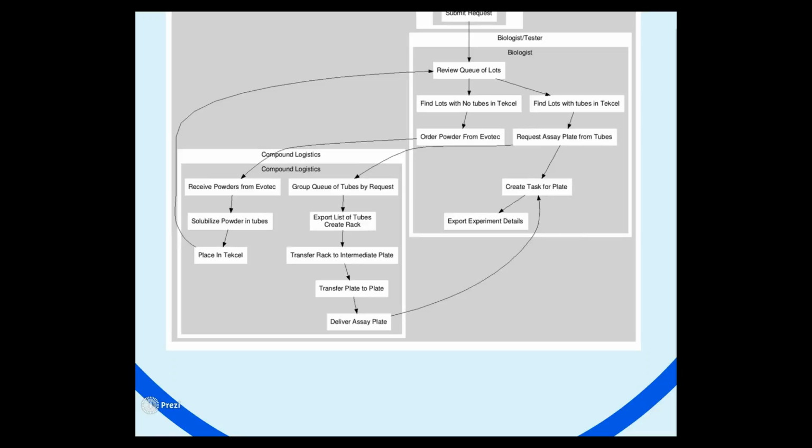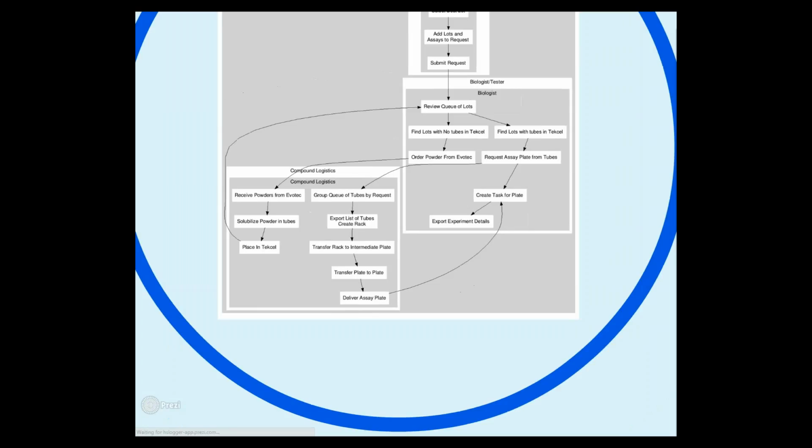So again, here we're interacting between project teams, between assay scientists, and also between the compound logistics or sample management groups to manage different aspects of this workflow. So we need a system that's going to support us during the workflow to optimize turnaround and make sure everybody's kept in touch with the workflow that's going on.